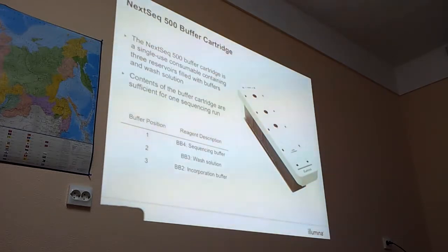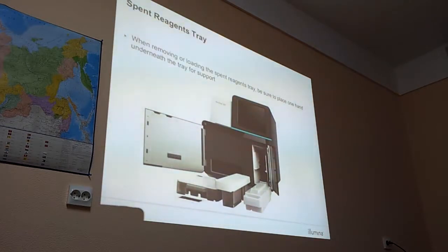Good to know because you also have a wash cartridge, and there you fill only the middle position. And yeah, this is how you load it into the system. So this here is the waste. Yeah, we call it spent reagent tray.